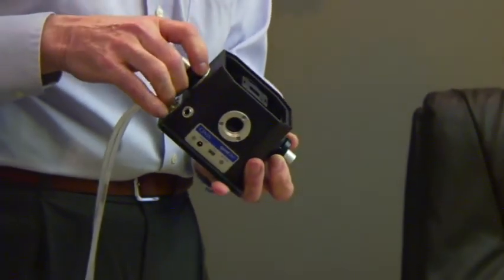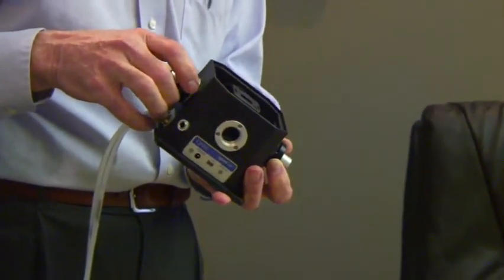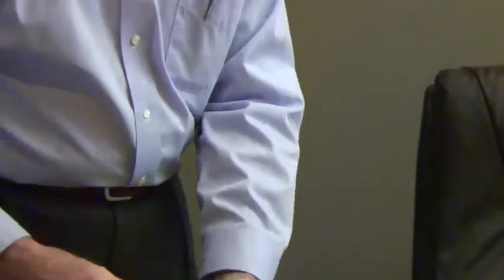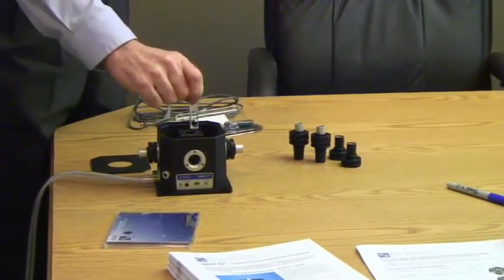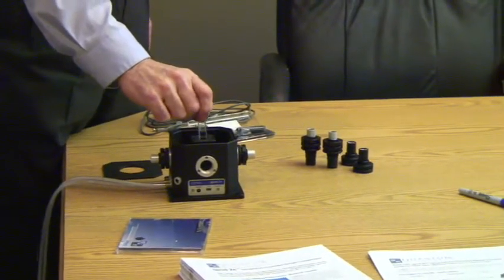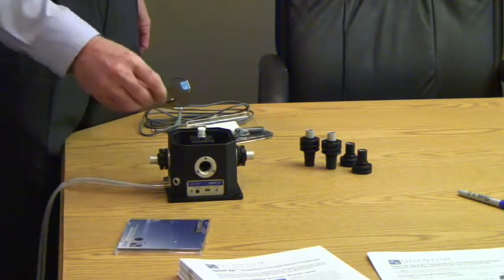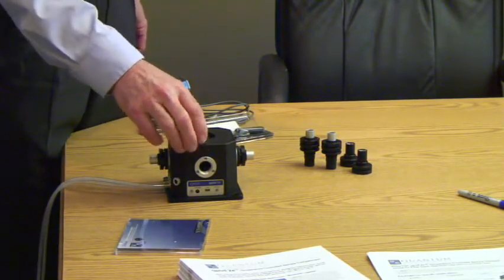Or if you want to use a very small micro-cuvette and you want to control where the light hits the cuvette, we have a magnetic stir bar that you put in a cuvette. It's very important to have stirring when you're controlling temperature, because what you want to do is maintain uniform temperature.